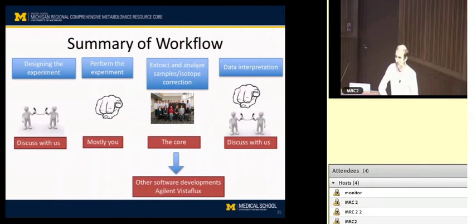Yeah, so that's a great thing, and I actually thought about incorporating some slides that would suggest the useful information that you can get from both approaches. Flux is really good at showing you information about particular pathways, or metabolic flux using a stable isotope tracer. What it's less good at is telling you total oxidative metabolism that's occurring. There are so many intermediates, so many things to measure. A nice way to do that is just to measure oxygen consumption and or CO2 production, and that's exactly what the Seahorse does. It will tell you how the total flux changes under different conditions.